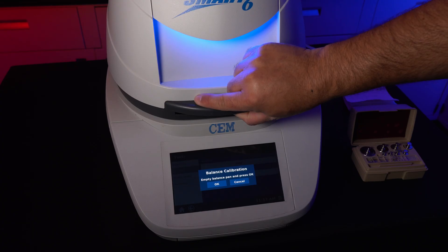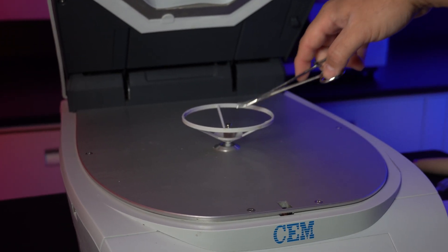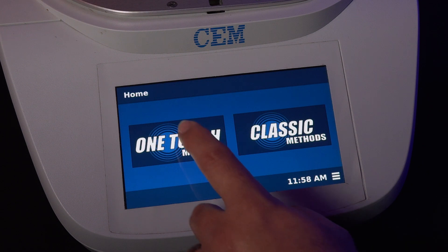Press Start under Balance and follow the instructions on the screen. Grab the 10 gram weight and place it on the balance. Once calibration is successful, press OK and remove the weight.